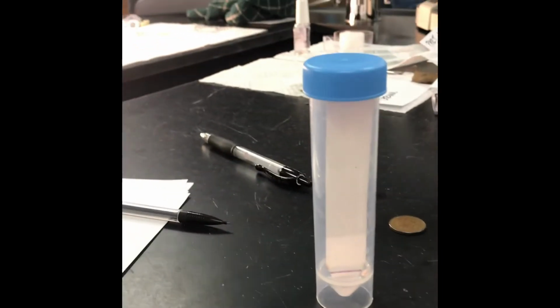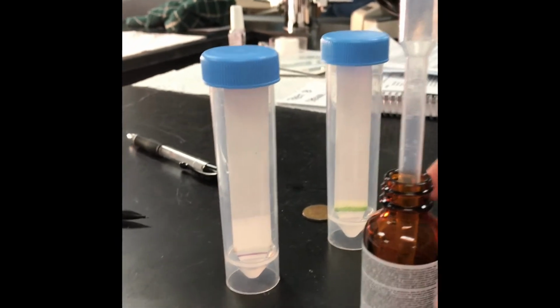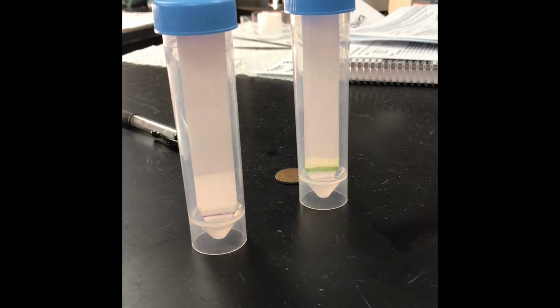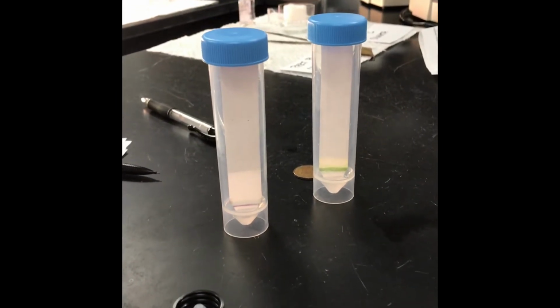See, it's easier to see it with that light behind it. Isn't that cool? I can see it moving. Can y'all see it? Negatory. Solvent line. And that is a perfect pigment line. I think you're going to get all the pigments come out. Good. Okay, so we'll let these run for a while.